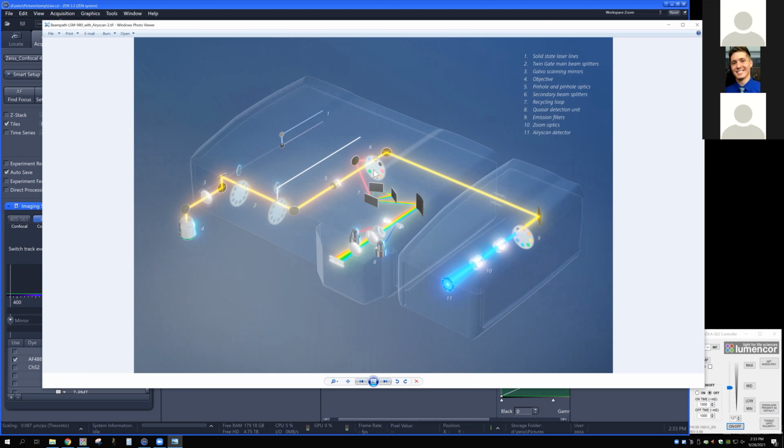And this is given to us by this first filter wheel that you can see right here. If you're only doing confocal, then you'll have this set to be a mirror so that all of your emission signals are going to be sent to this internal confocal detector here. If you want to use the Airy Scan, then we have a couple of different filter options here that are going to allow light to pass through and make it to this extra shoebox that we have on the right-hand side of the scan head. Once we get to this point, there's a second filter wheel that we can use that will, in combination with the first one, determine what wavelengths actually reach the Airy Scan detector.